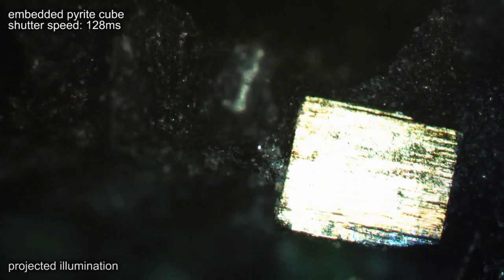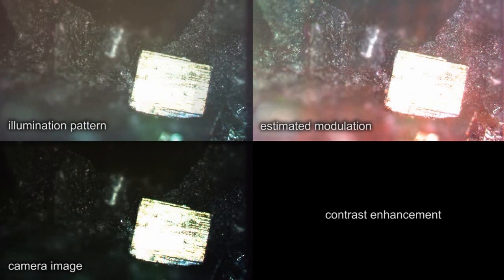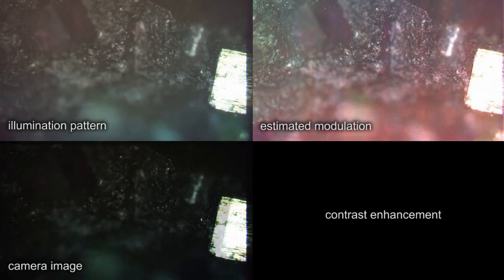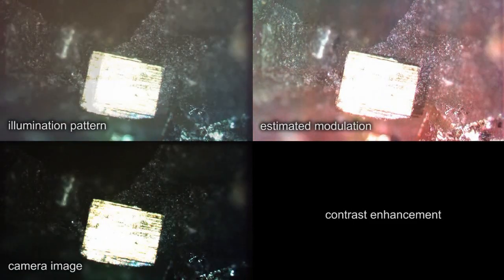We have developed a closed projector camera feedback loop that estimates the modulation of uniform white light with the specimen, even though it is physically illuminated with an arbitrary illumination pattern. This allows us to move the sample or change the microscope's parameters while using the technique.